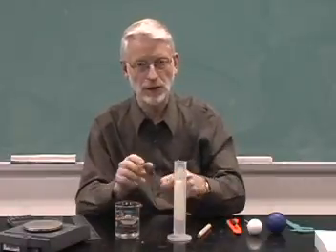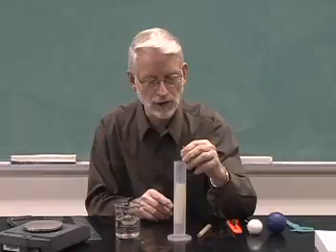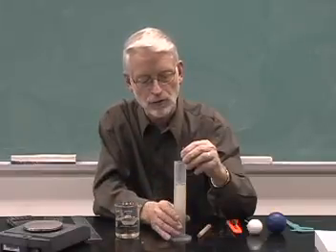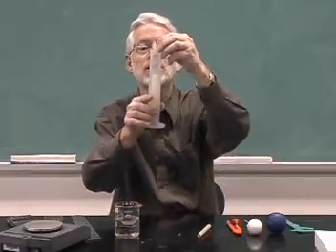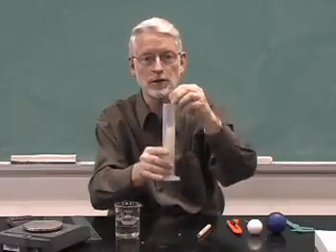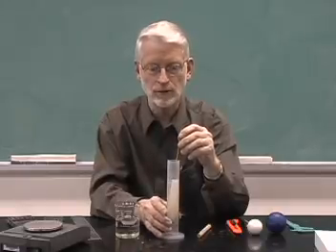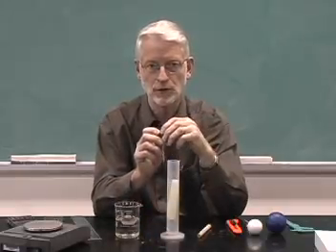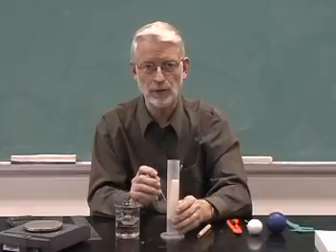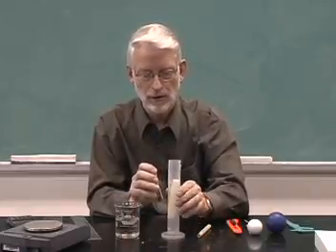So we start with 67 milliliters, and now I just make sure I press it just underneath the water surface. And here it's at 97. So that means that the volume of the candle is about 30 milliliters, the difference between the two. And you can then compare that with the calculated value for the volume.